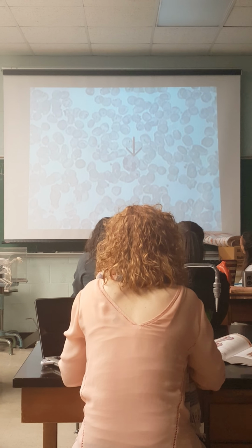That would look like. There we go. So it's a leukocyte, it's a white blood cell. Did you just keep saying everything was white blood cell? Did I? Red blood cell? Okay, so I'll get back to this. Red blood cells. Actually, sorry, I've been off this one. Sorry. So these are all red blood cells, and then we have a leukocyte right in the middle.